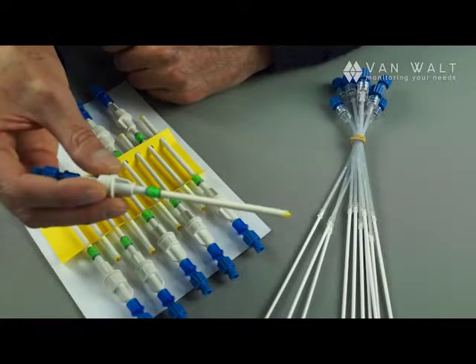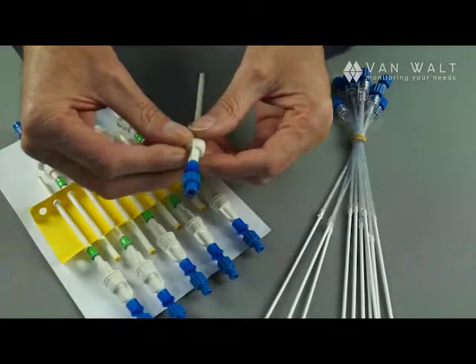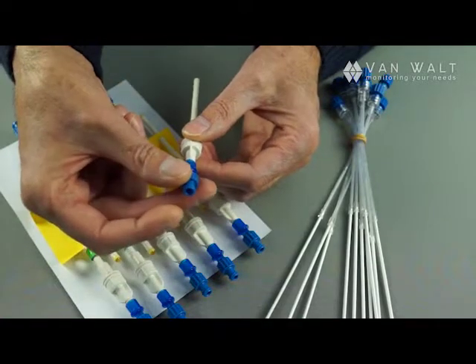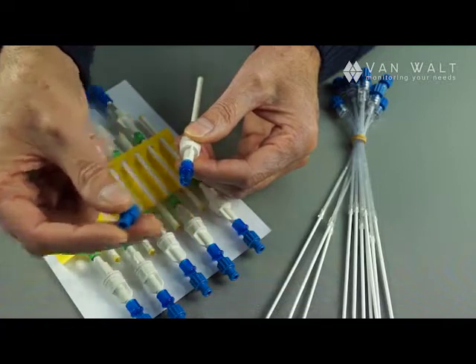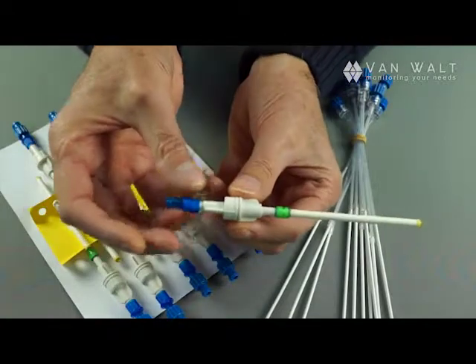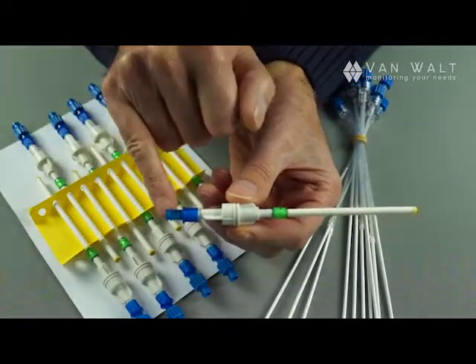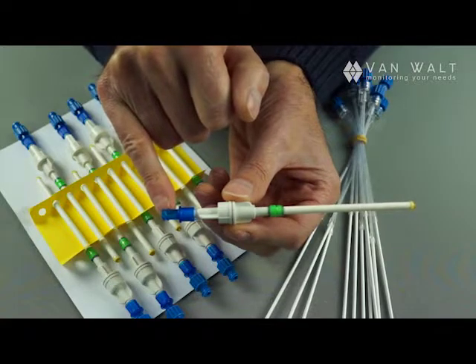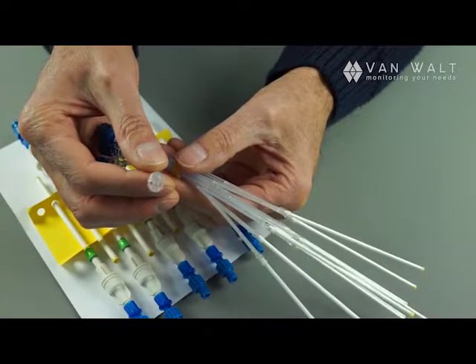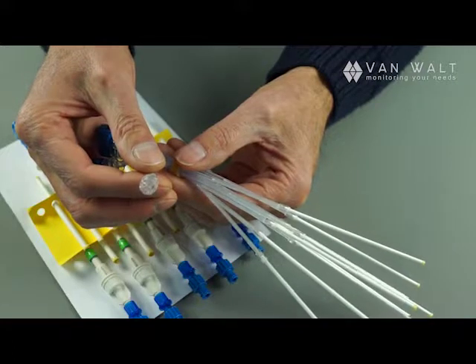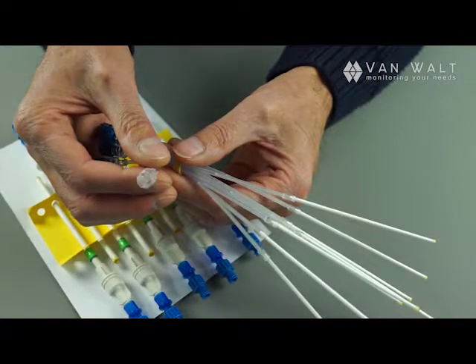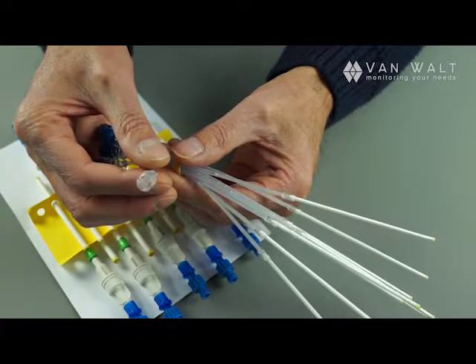On the other side of the sampler you have a connector. These are typical Luer connectors. They come with a blanking cap which is unscrewed like this. And you see in this particular instance, in the case of the macro rhizome, this terminates in a male Luer connector. In the case of the micro rhizome the termination is a female Luer connector, which means that any device that you use to create a vacuum, be it a syringe or a vacuum tube, should have the correct fitting on there.